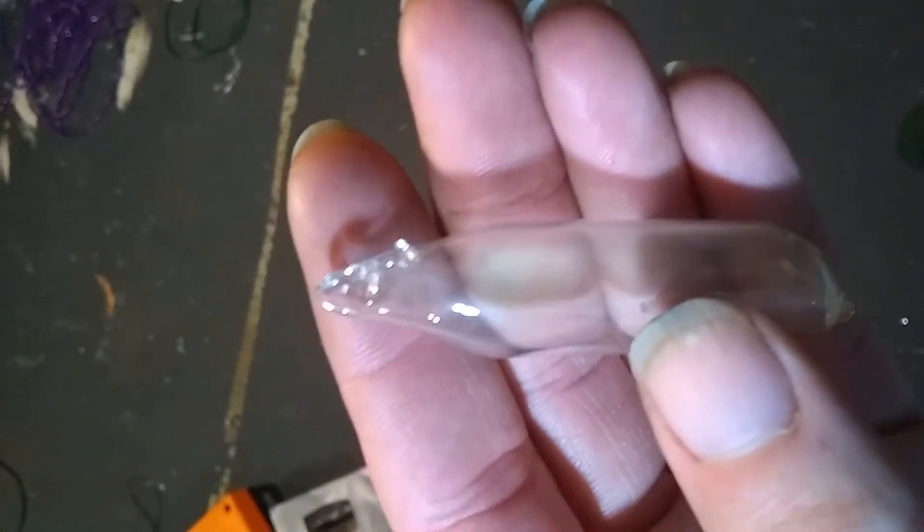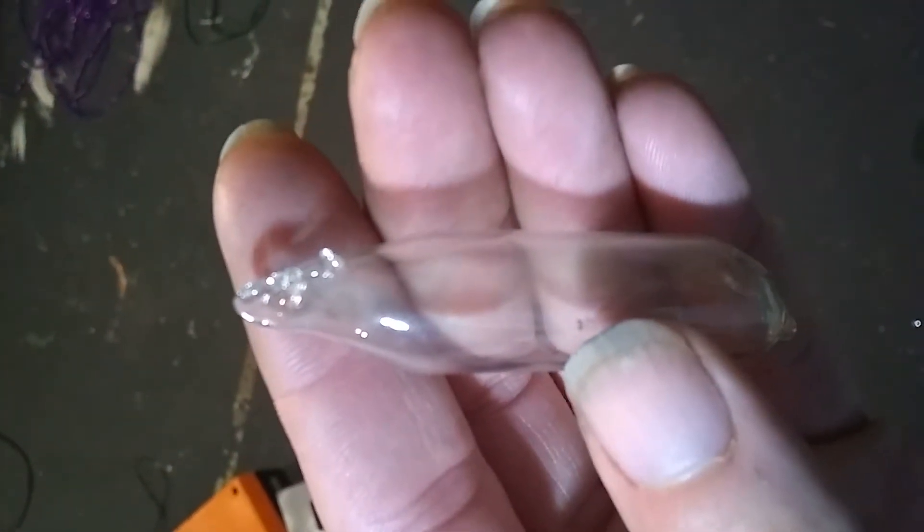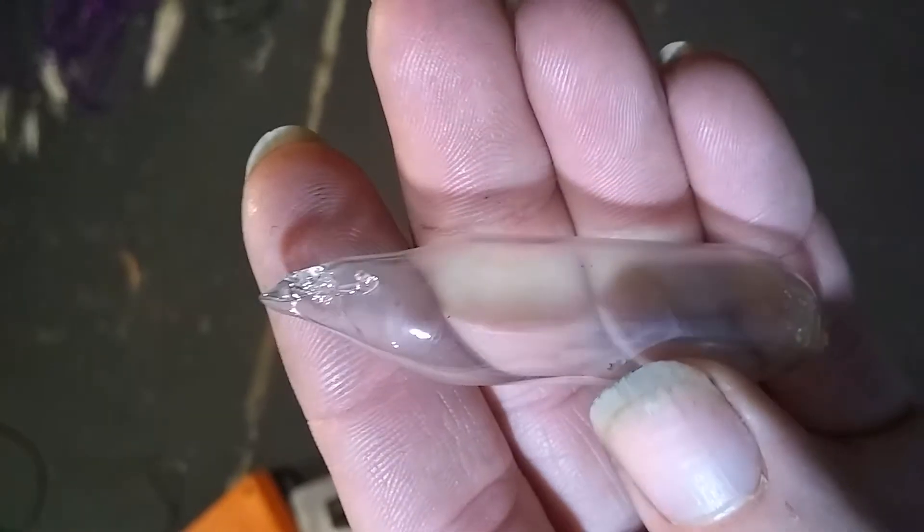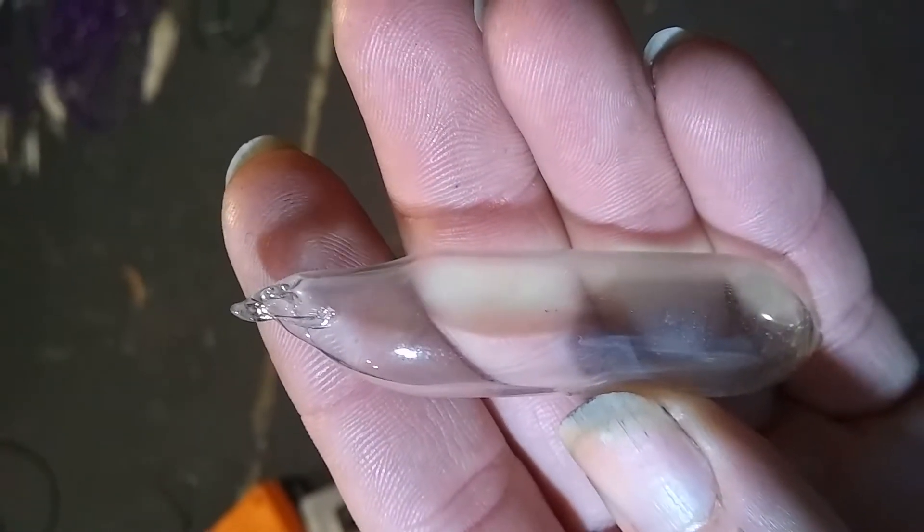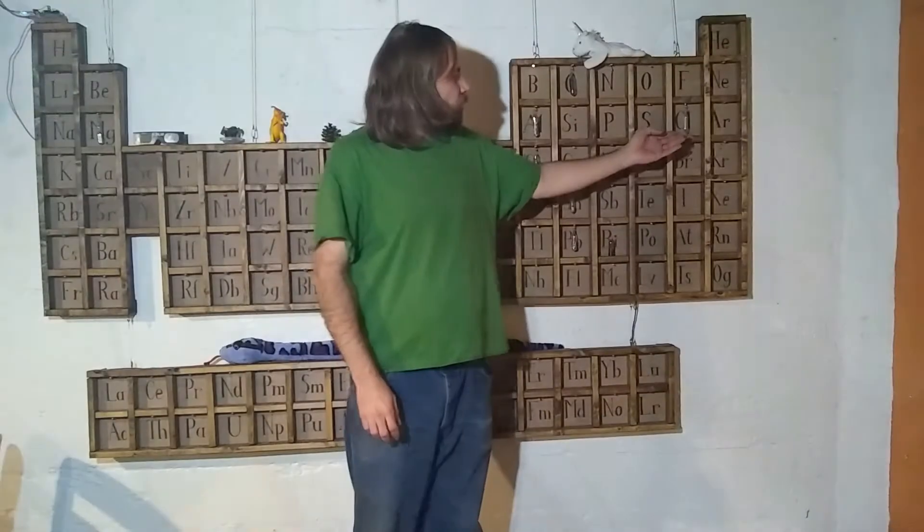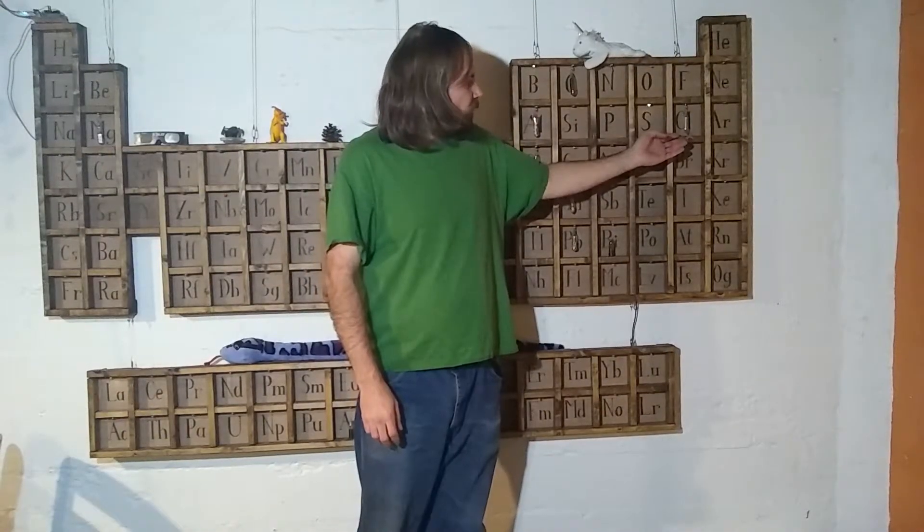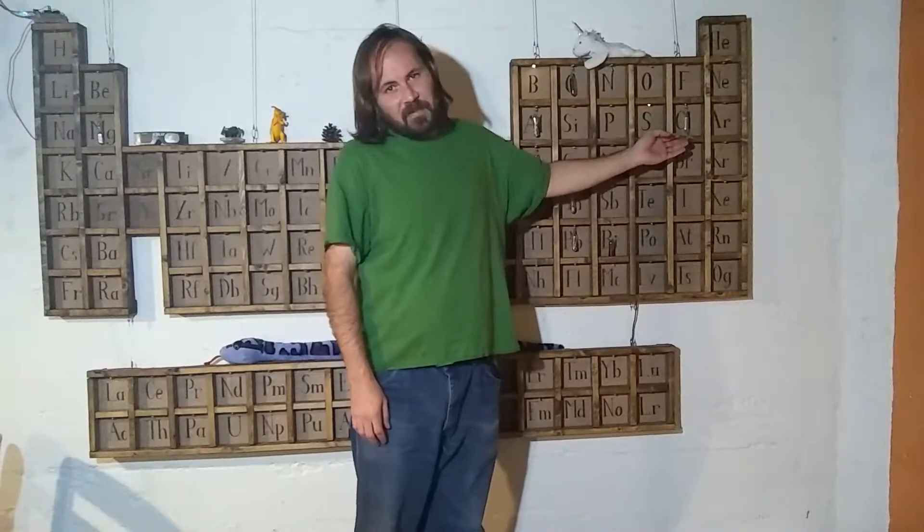Really bad news here. I thought I smelled bleach. There is a hairline crack in the ampoule.